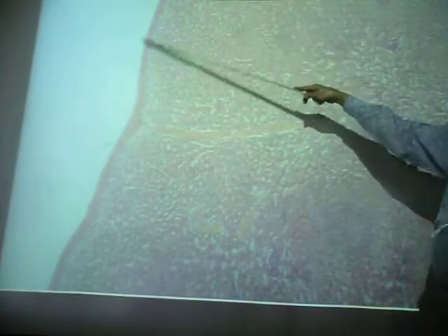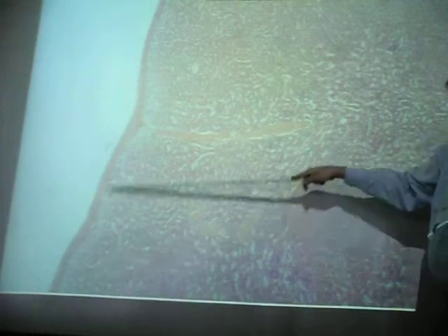All right, let's look at another lymphatic organ. And this is the spleen. Now the spleen again has a capsule about it, but you may or may not see the capsule on some of the slides you looked at. Because remember, the spleen's a fairly large organ. You have identified it on those models. This one has a capsule along only one side. And that's what this is. Again, it's a dense fibrous connective tissue membrane that surrounds and protects the organ.